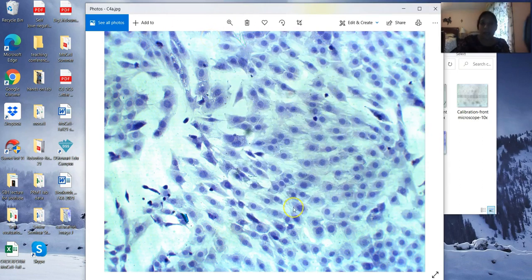Let's say that I was using a microscope to take the image of my slide with these cells at 100x magnification, so using the 10x objective lens. Then I also need to take an image of my stage micrometer using the 10x objective lens on the same exact microscope. For best results, you don't want to get those images from different microscopes, even when they're from the same company, because there may be slight variations or slight issues with the calibration of one microscope versus the other.